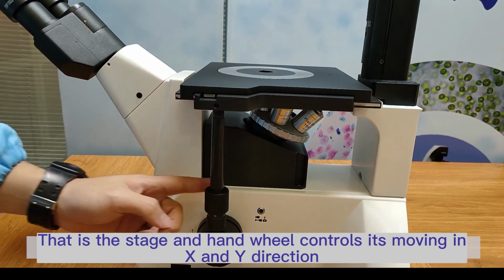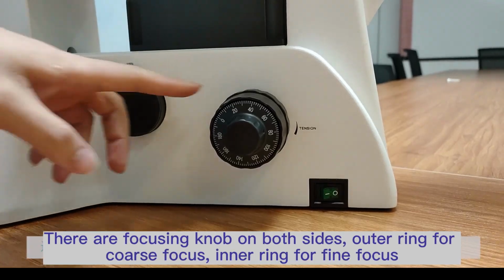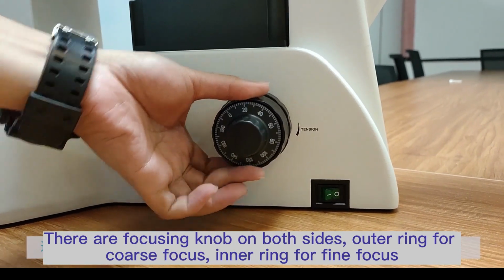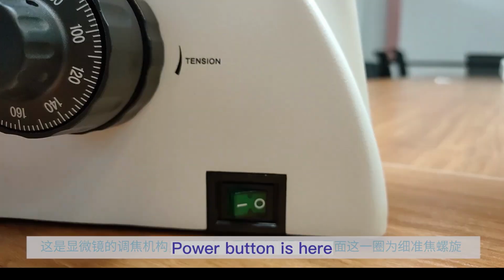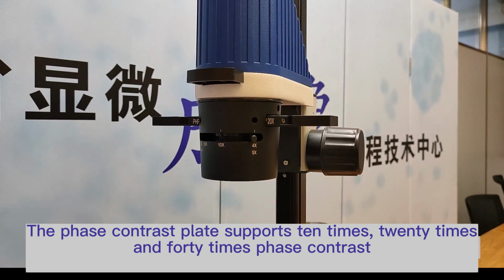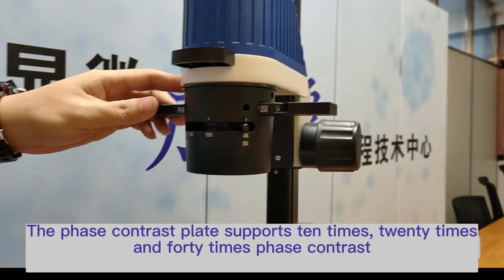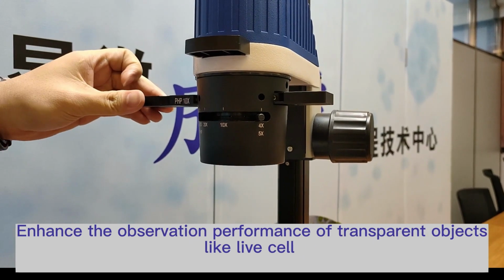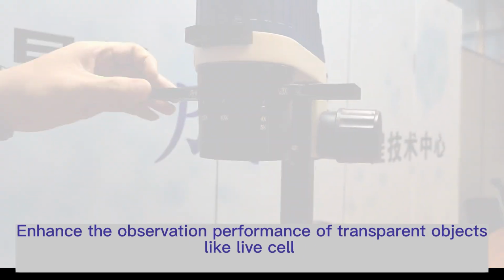That is the stage, and the hand wheel controls move it in X and Y direction. There are focusing knobs on both sides. Outer ring for coarse focus, inner ring for fine focus. Power button is here. The phase contrast plate supports 10 times, 20 times, and 40 times phase contrast. Enhance the observation performance of transparent objects, like live cells.